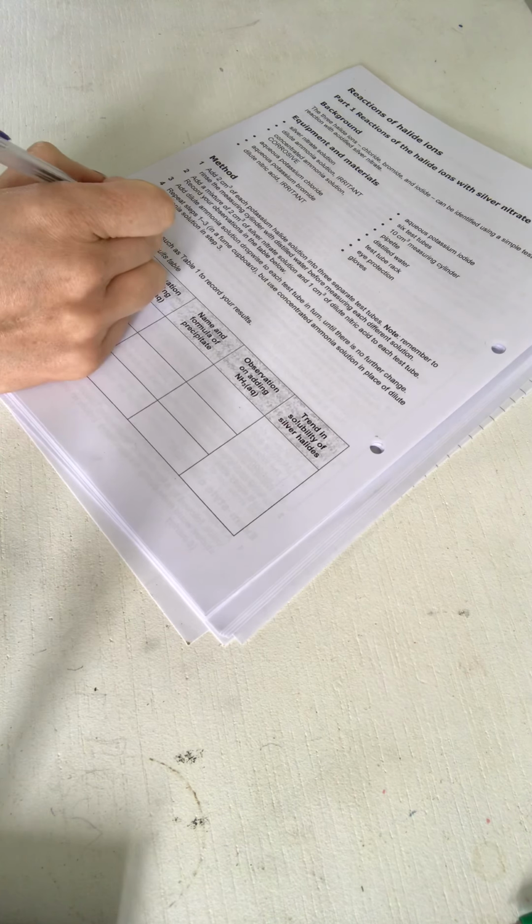Okay, so I'm going to talk you through worksheet 7, which is the practical worksheet. Very briefly, I'm going to talk you through experiment 1. The reason for the brevity there being that you study this at Key Stage 4. This is simply the test for the halide ions, okay?